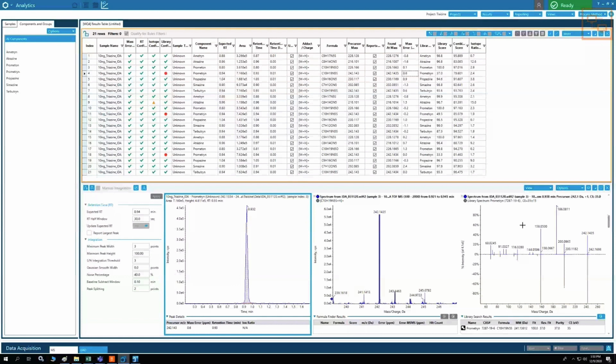But these are the kind of things that you have to look out for in your screening. And I think what we'll do, unfortunately, we discovered this now, so we know it in our minds. But when we do the in silico fragmentation, maybe we'll do that tomorrow. We'll use the same data and we'll look at it and see how that affects the in silico fragmentation, or let's say the building of the structure from the data, because that will affect it.